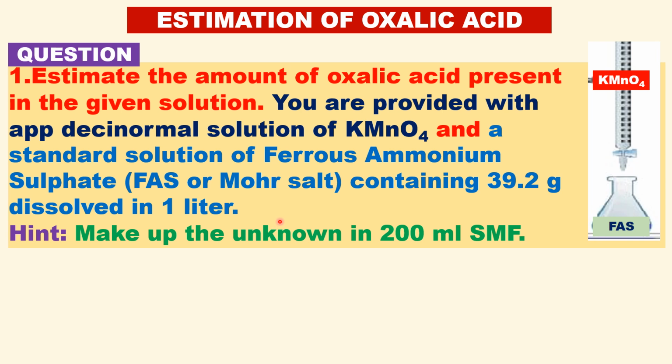In the hint, the teacher will tell you to make up the unknown in a 200 ml SMF flask, standard measuring flask, or 100 ml SMF flask, or 250 ml, whatever it may be. We'll see in the calculation how we will be using it.